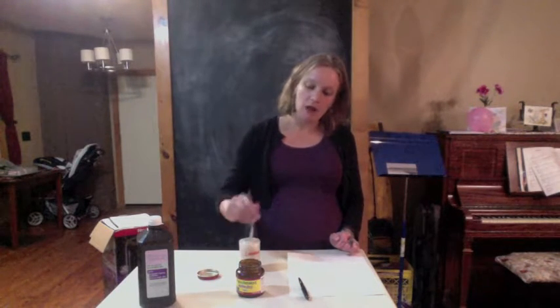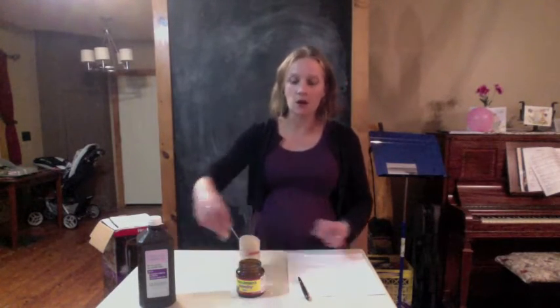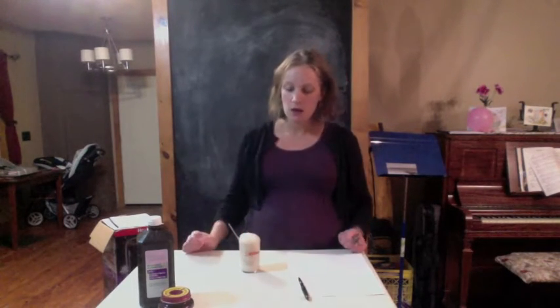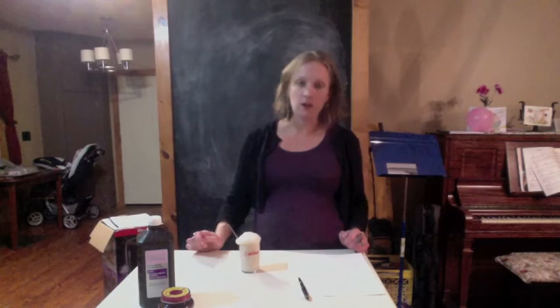So you have the reaction for this in your lab book that you can balance, and you also want to perform this reaction yourself and tell me what you observe. I want to see a picture of it or a video to show me that you did it. It ends up looking like a root beer float. And that is the function of a catalyst.